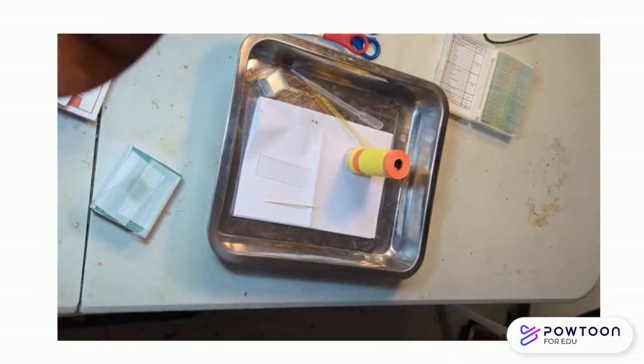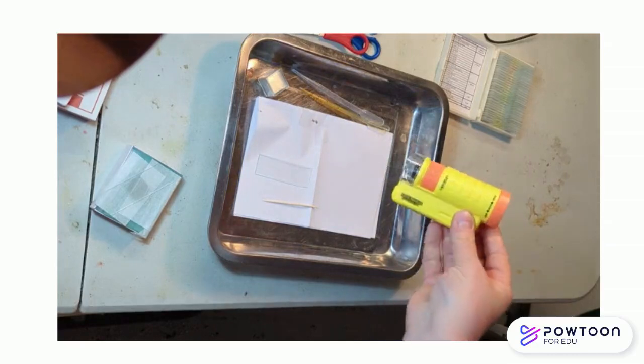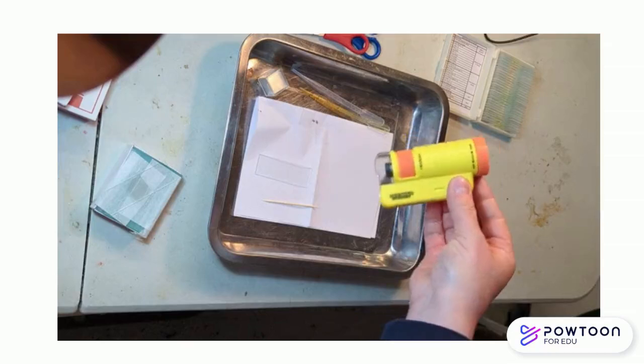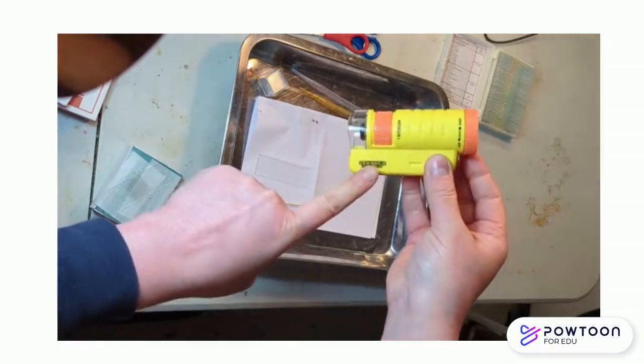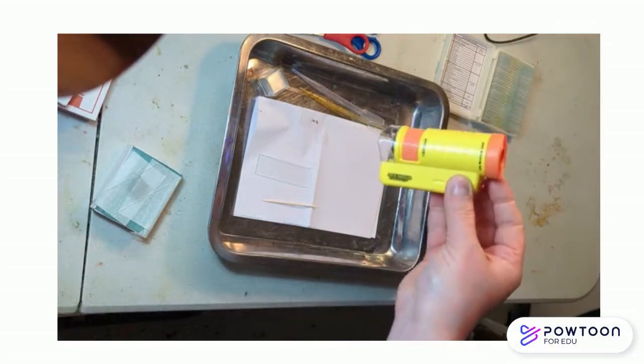Hello, this is a video to train you on the basics of the biology classes. When we start doing DNA, we do not really use microscopes. But when we start talking about cells, it would be impossible to do that without one. Now, this is the kind of microscope we have for most classes. The advantage is that this doesn't need a computer, so we do not have to worry about the school's permission.